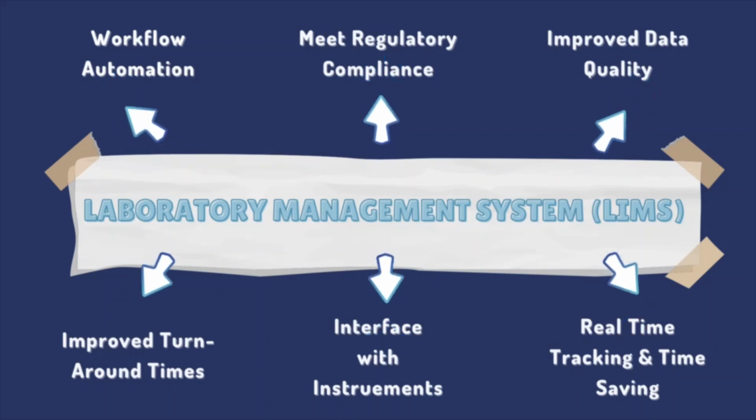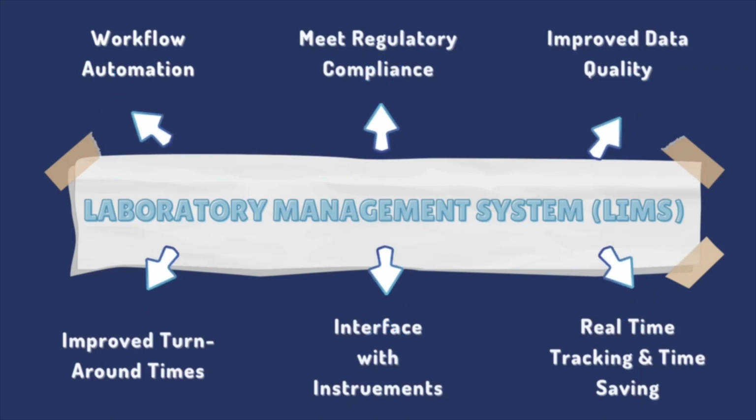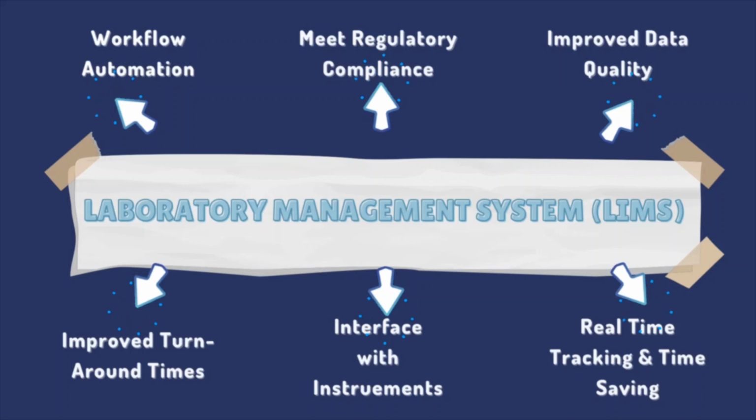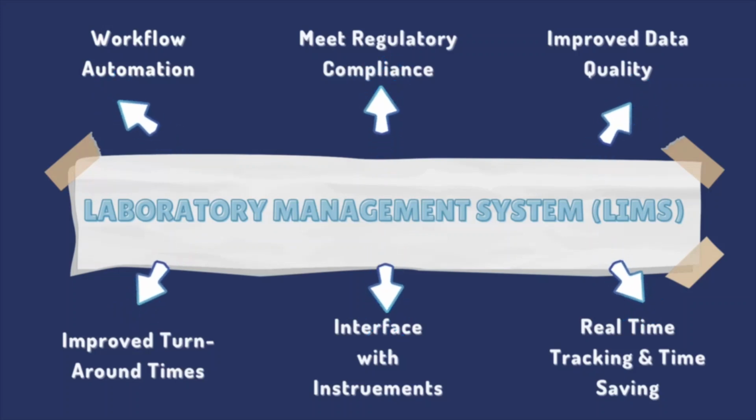There are a few stages in LIMS. There are 5 core stages. Receiving and logging in of samples is the primary step. Then it is followed by sample assignment, scheduling, and further tracking before being analyzed, sample processing and quality check, data storage with sample analysis, and final report generation after inspection, approval, and compilation of sample data.